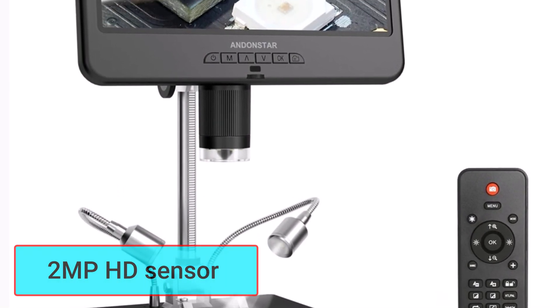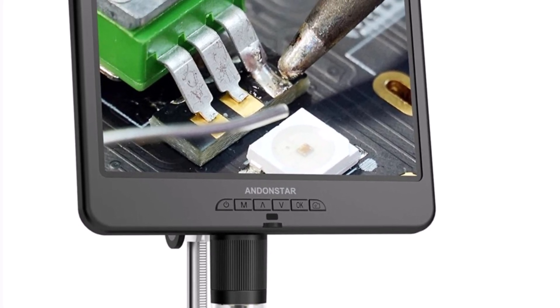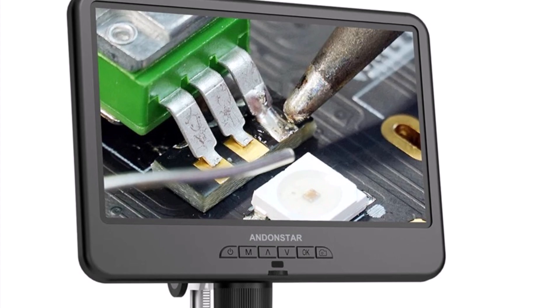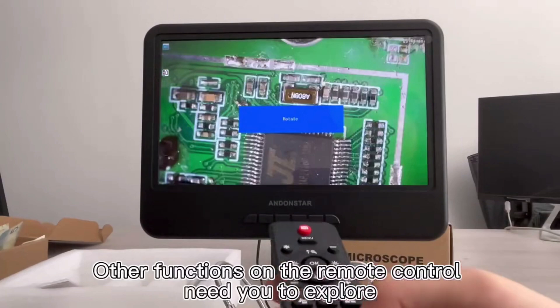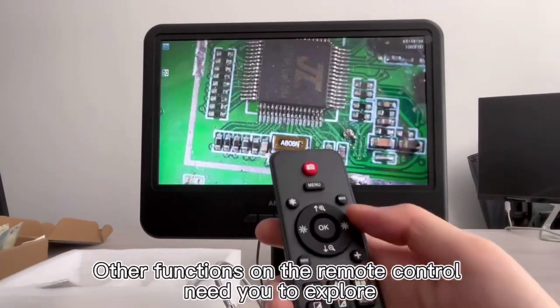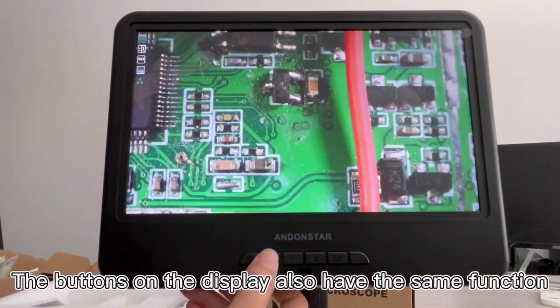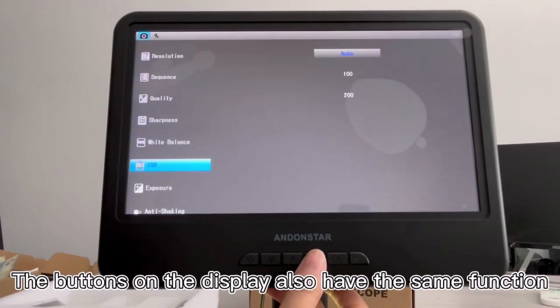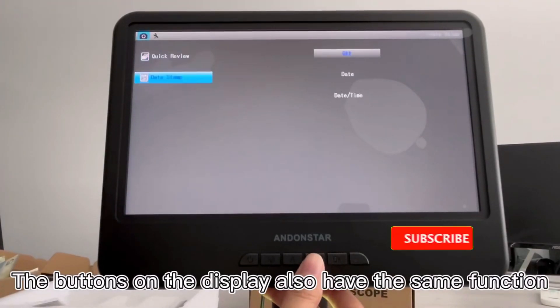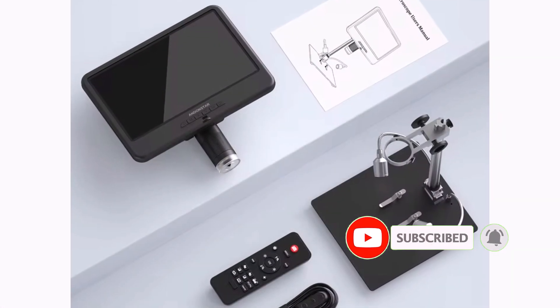The HD sensor captures crisp photos with a maximum resolution of 12MP at 4032x3024, and smooth videos at 30fps in AVI format. Built with a durable metal body, this microscope ensures longevity and stability. It's powered via USB 5V DC, making it compatible with most workstations. The compact and portable build further adds to its usability, while certifications like CE, FCC, and ROHS ensure compliance with safety standards.